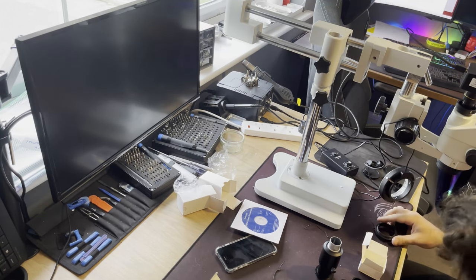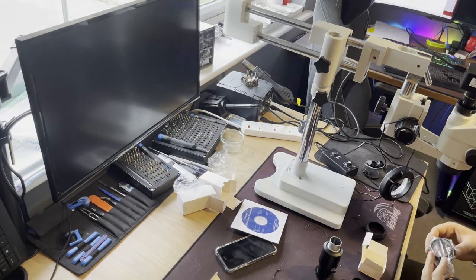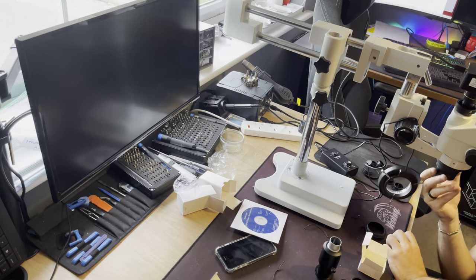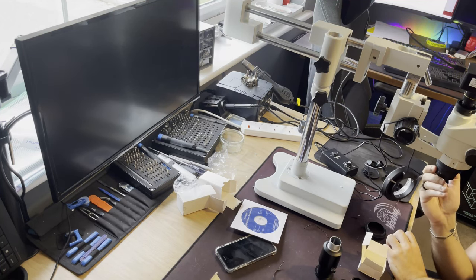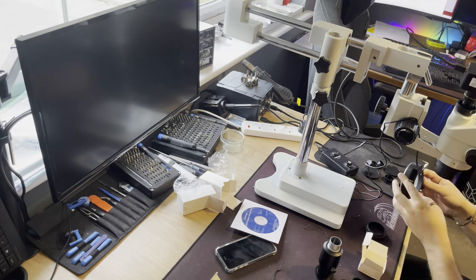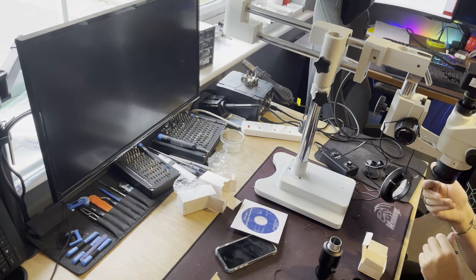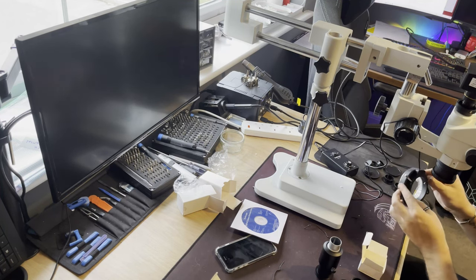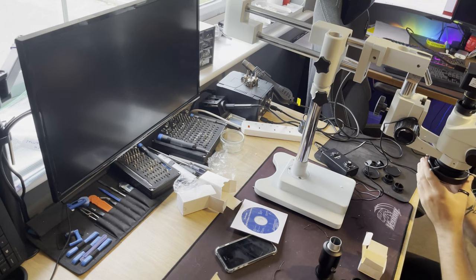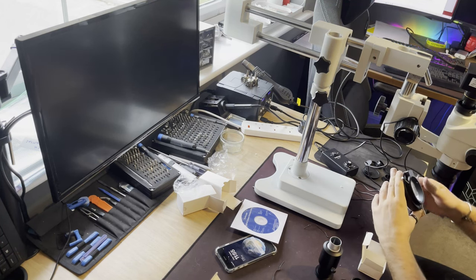And I'm not sure. So I'm guessing these lens, this is the barrel lens, so here we go, it's perfectly here. And now I'm guessing, hold on, let's see if this one actually fits here. Yeah, now it kind of fits perfectly. This one's still not very as it should really.